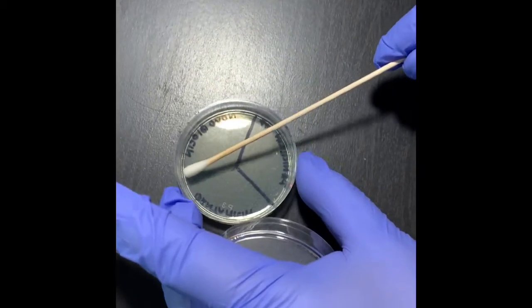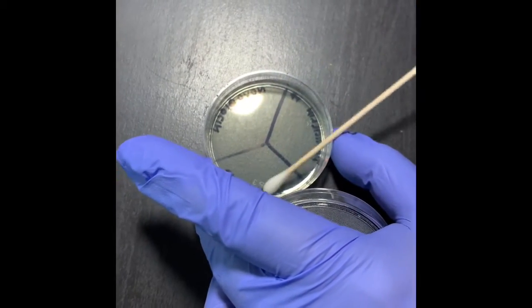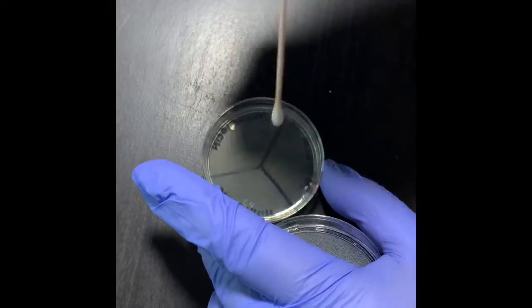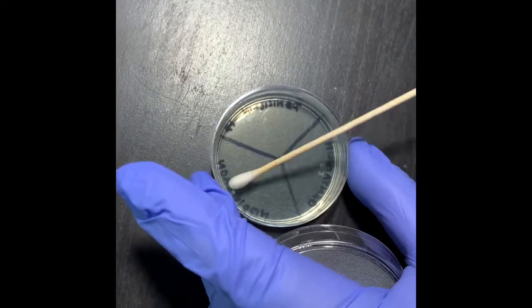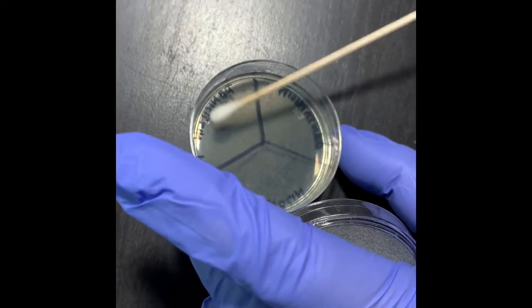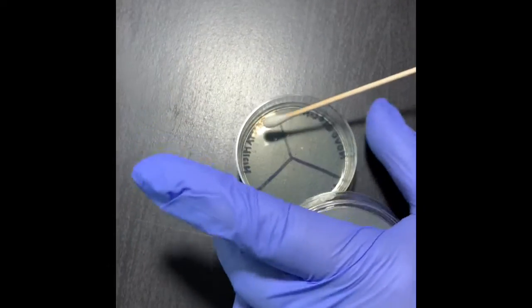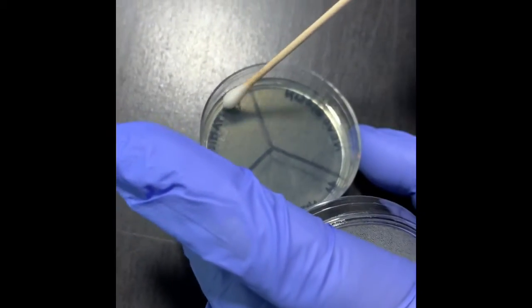Then I go from the corner side, and don't press too hard because the agar is so thin, but make sure that you touch all the sides and corners, and no point is left untouched. If you want, you can hold it against the light to make sure you are touching everywhere. Make sure you touch the edges clearly.